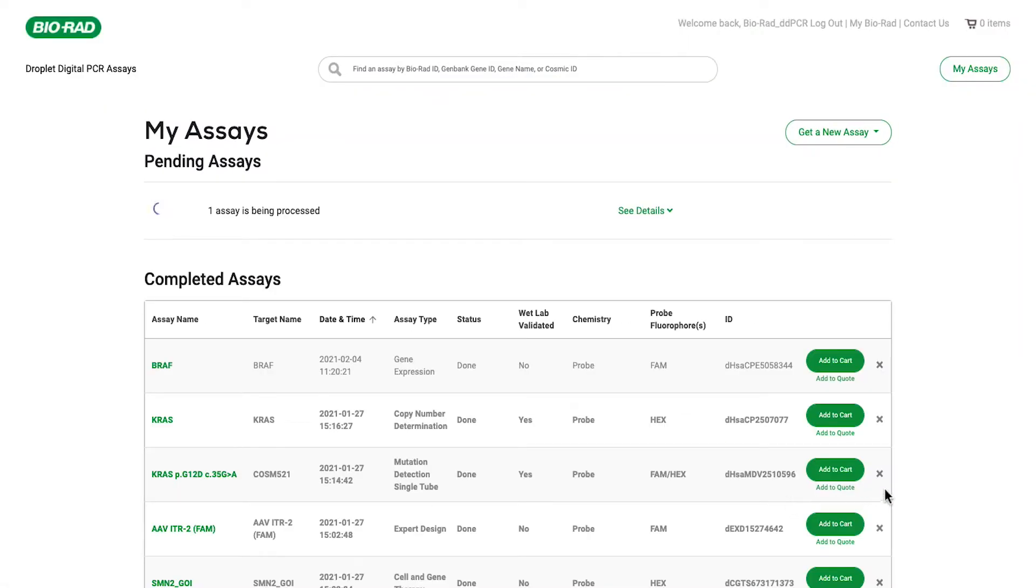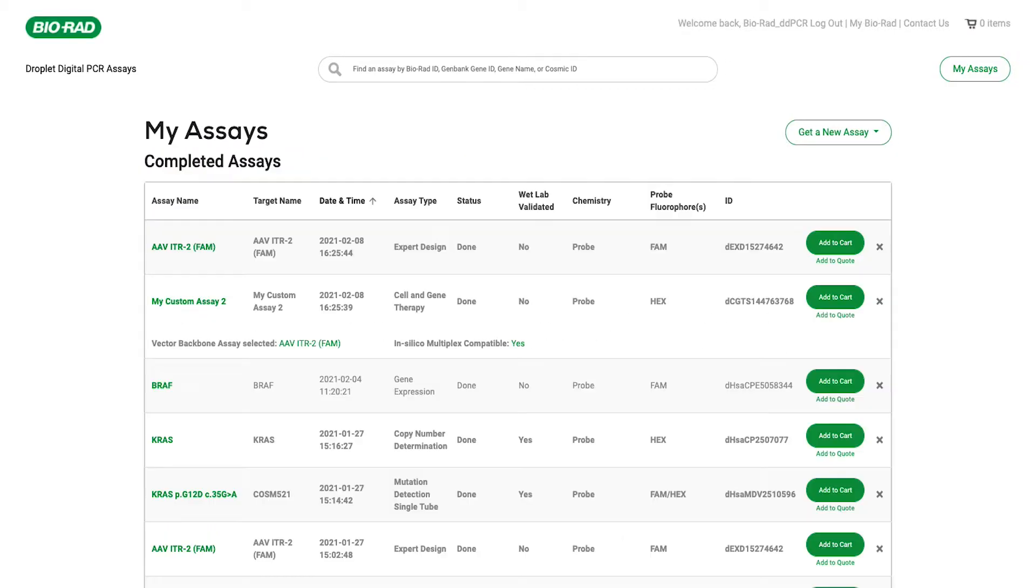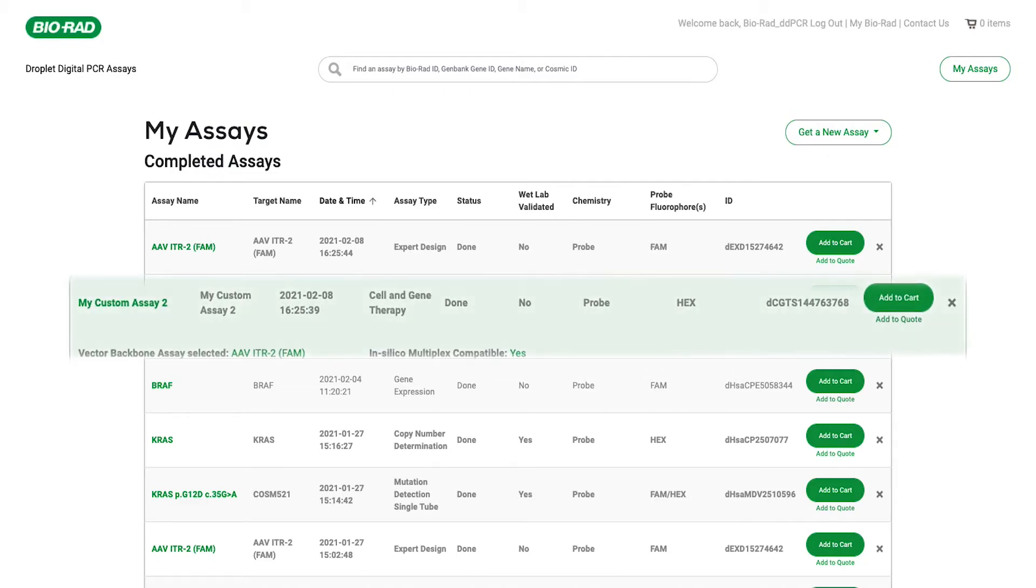The cell and gene therapy design engine can also perform in silico multiplexing checks between pre-designed vector backbone assays and your custom assay.